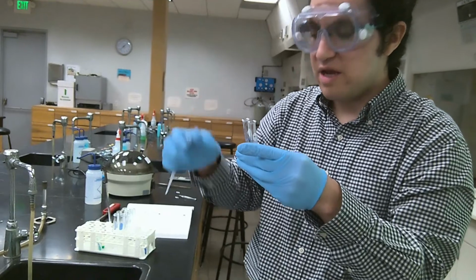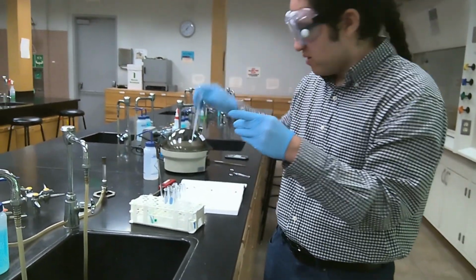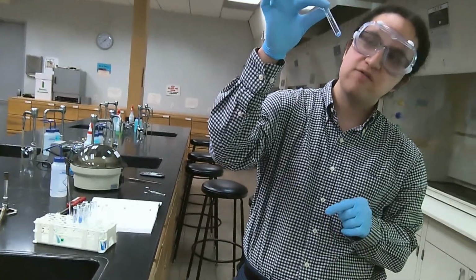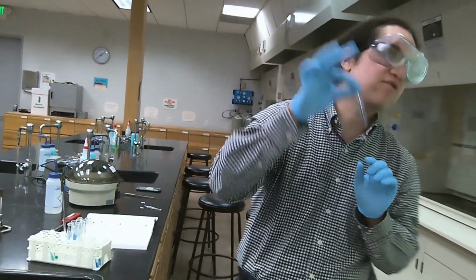Now before we remove the remainder of our liquid, we want to test to make sure there's no additional copper hydroxide remaining in our supernatant liquid. So we're going to add a few more drops of sodium hydroxide.